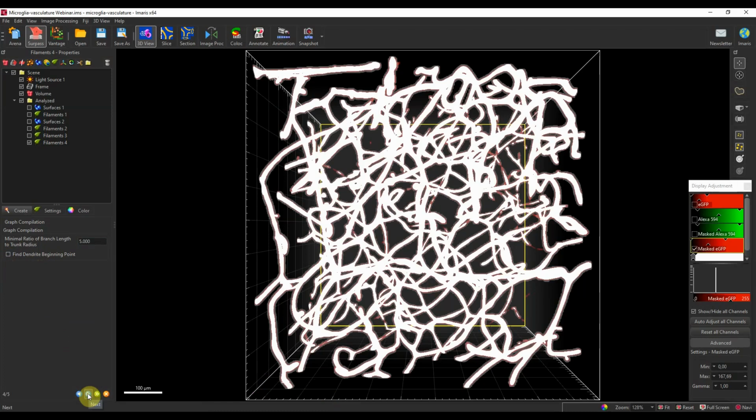Again, to save some time, I will not perform it at the moment, but I will rather show you the finished results. The last step, as you can see, is not really the final step of the wizard. I just want to let you know that the last step is where we can delete this working channel that we have created. Once the calculation is done, the result would look like this.